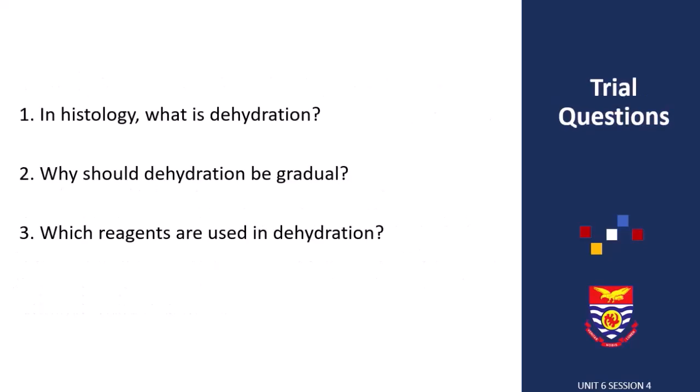Now have a look at these questions. In histology, what is dehydration? Why should dehydration be gradual? Which reagents are used in dehydration?